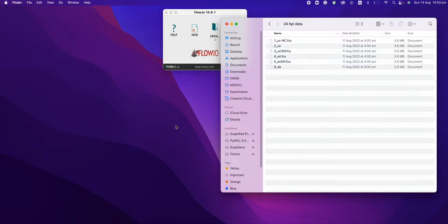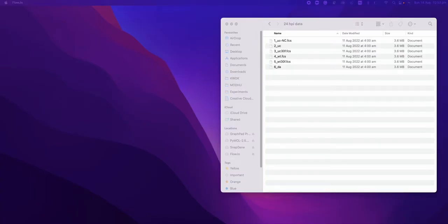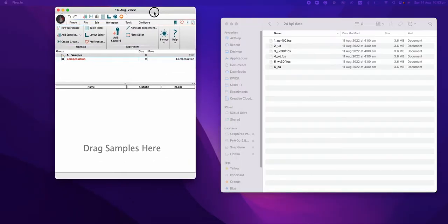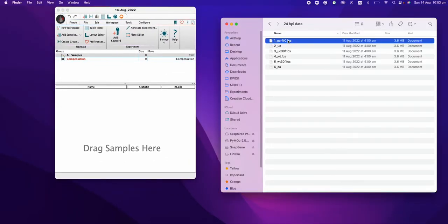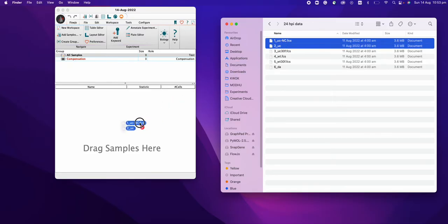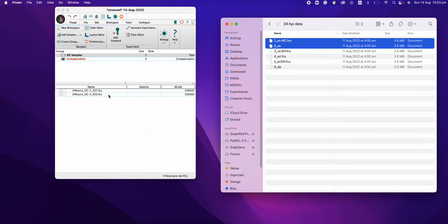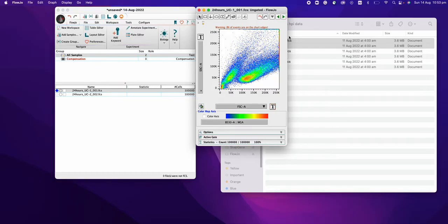How to analyze the effects data using FlowJo tool. I'll create a new workspace and then drag the sample which I would like to analyze — so for example these two — and I will now clean up my data.